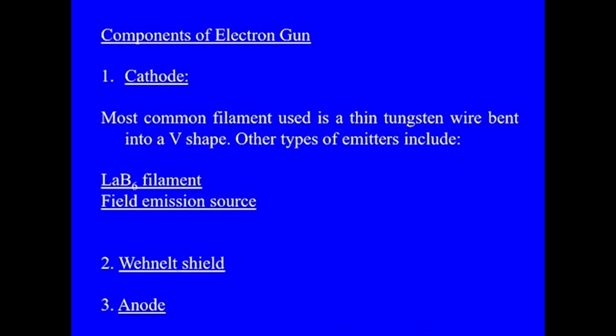You must have heard about field emission electron microscopes. Now, this requires very high vacuum conditions like 10 raised to power minus 9 torr, and it operates at room temperature. It requires a single crystal of tungsten with an emitting region of approximately 10 nanometer. Now, the brightness is almost 1000 times that of standard tungsten filament, and it employs double anode. First anode around 2000 volts extracts electrons from the tip, and the second anode accelerates electrons down the column.